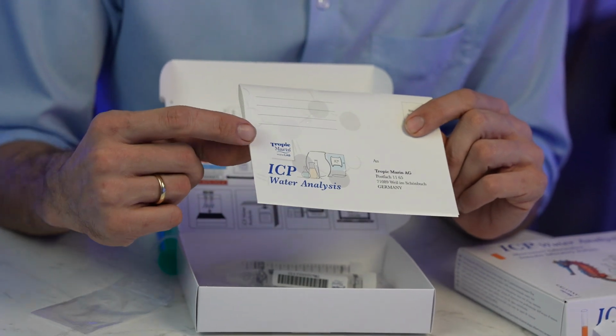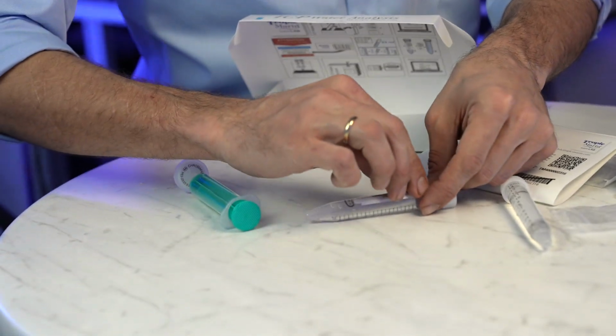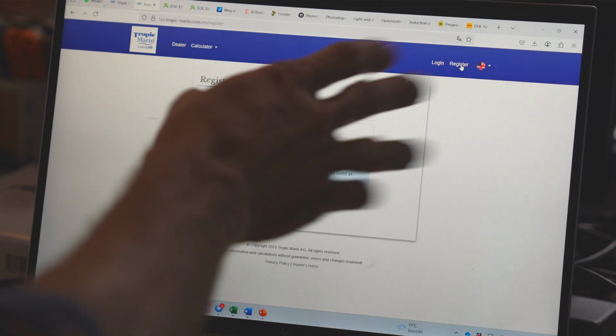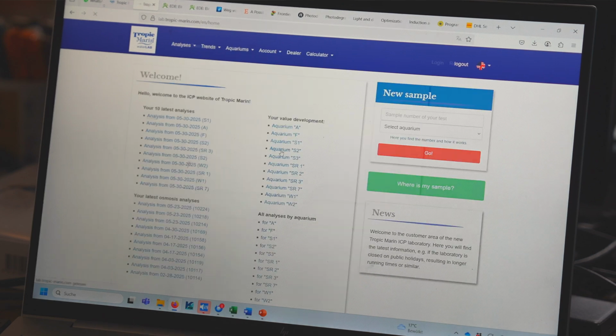Once we did all that, and it's off to the post office and arrives here, it will be scanned. What does that mean? So these barcodes need to be connected to your account. Basically, you have to go to the website, Tropic Marin Water Lab. It's actually lab.tropicmarin.com, and conveniently it's already on my screen here. If you haven't done so already, you can register. Just put in an email and password, super easy, super quick. And then you have an account, or in our case, you log in and ta-da, there's your account, all the water analysis, etc.